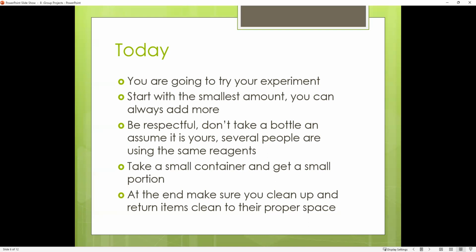So how do you know? Well, if you're going to titrate, what we usually aim for is that we use between like 10 to 15 mils of titrant. If you use too small a volume of titrant, you have a lot of uncertainty in those volumes. And if you use too much, you don't gain anything. So we try to aim around that number. And so how do you know?